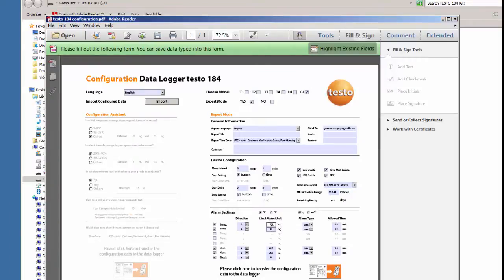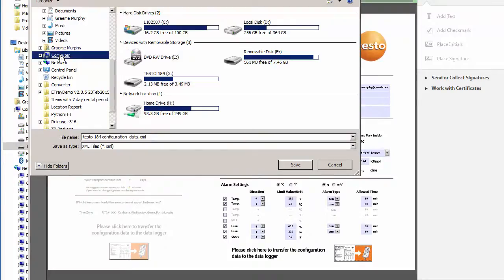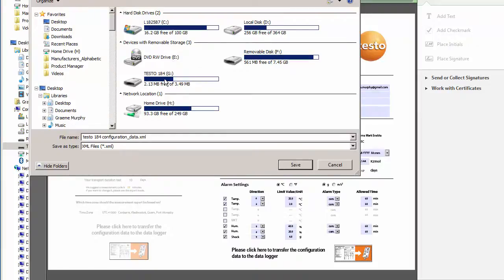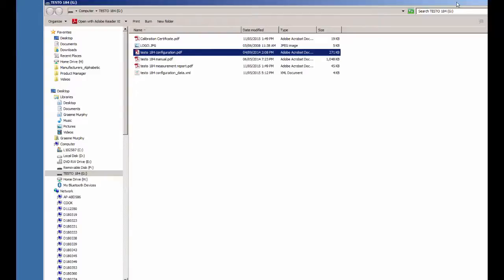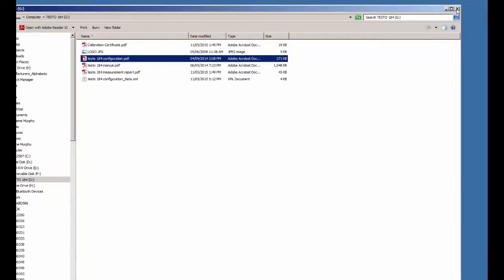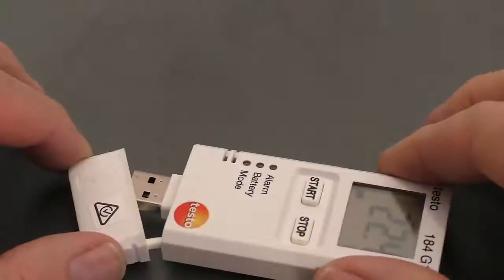There we go, and the humidity and G alarms can be set also. Now what we do is simply click this button. It'll ask to save, and we need to browse to the directory we've just opened — we've got to make sure we save it there. So I'll go to my computer, find the Testo logger, and simply save this file. Once we've done that we can exit out of the PDF without saving anything else. The instrument has been configured.